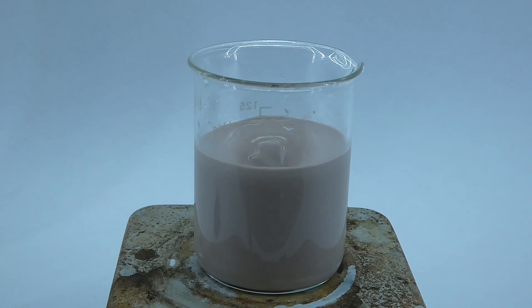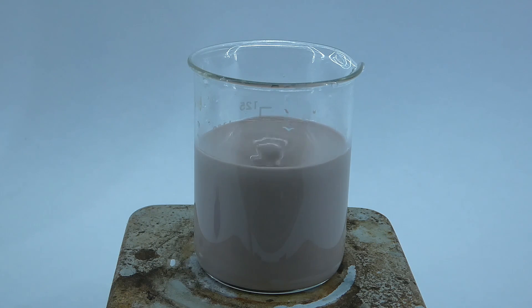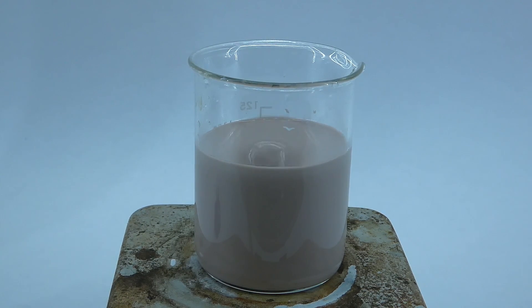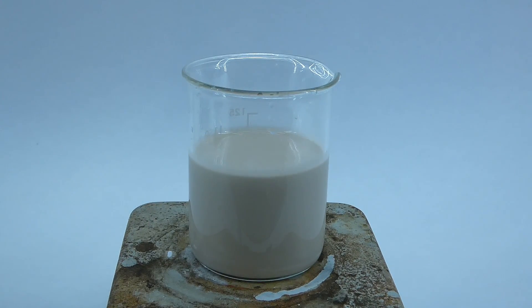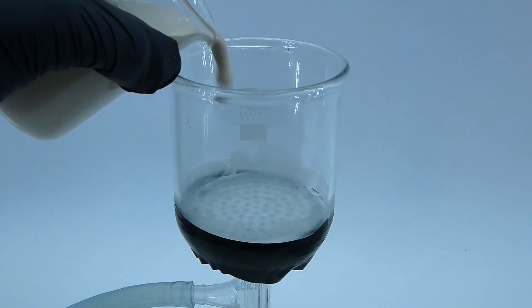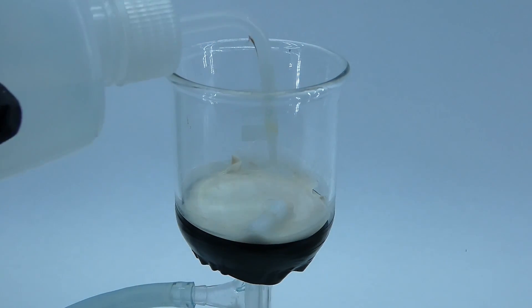Copper iodide is insoluble in water, and because of that, after I added all of the potassium iodide, the mixture became pretty thick. I now had to filter out the copper iodide, and to do that, I just ran the mixture through my vacuum filter. I also washed it with a lot of distilled water to remove any impurities.